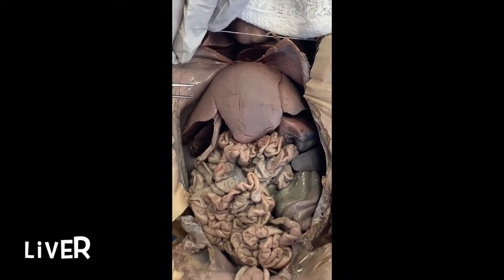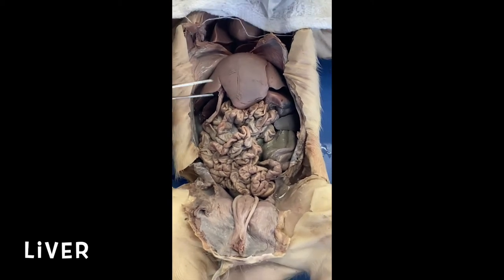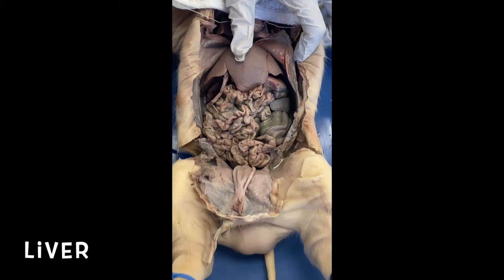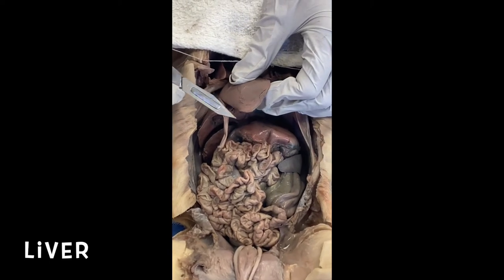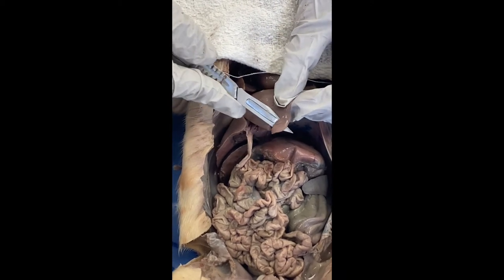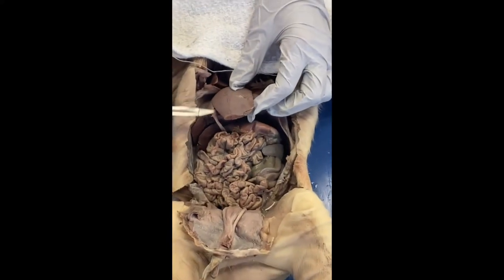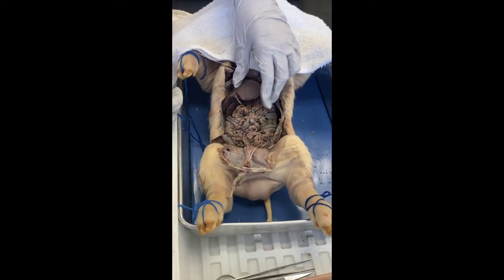This huge organ that is just staring at you when you open the pig in the abdominal region. This is the liver. There is one more lobe on the liver in the pig than the human. And so it's fairly large, taking up this whole region. One thing that I want to point out to you, and I'll just do it for fun here, is when you look at the texture of the liver, when people have liver cancer, because it's a very sturdy organ, you can go in and slice some off if there are cancer cells there. And it's not hard to operate on in that way. So you can just cut some of it off because of the texture and really how it's built, the structure of the liver.